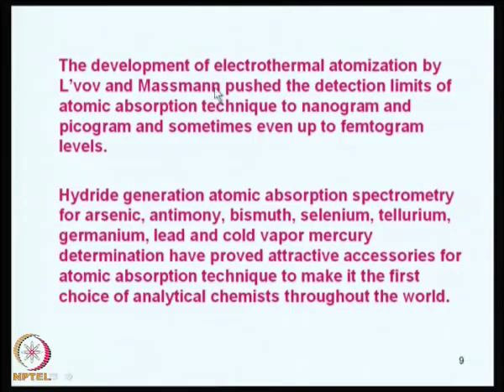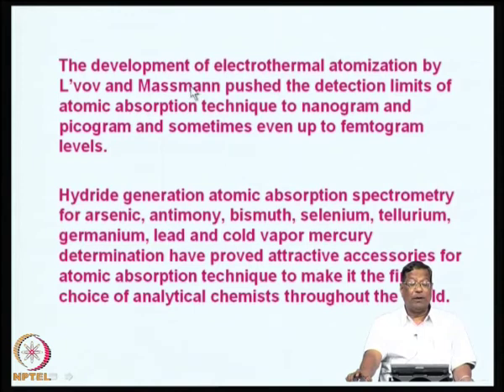And this was spearheaded by Professor L'vov of Russia, and Professor Massmann developed the equipment to achieve electrothermal atomization. And he pushed the detection limits of atomic absorption technique to nanogram levels, picogram levels and femtogram levels.